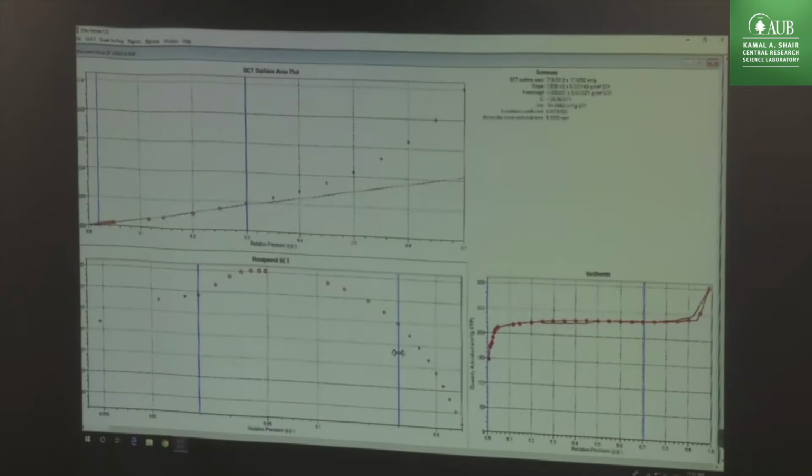So now let's adjust. What is the value of the fitting now? The fitting, if you count the correlation coefficient, is 0.99, but you can see it's a Rouquerol, so it is negative. Okay, Rouquerol, as I said yesterday, is number one in the whole world on the BET surface area. Monsieur and Madame Rouquerol. I spent six months with them, and they are very well known. They have many books on gas adsorption.